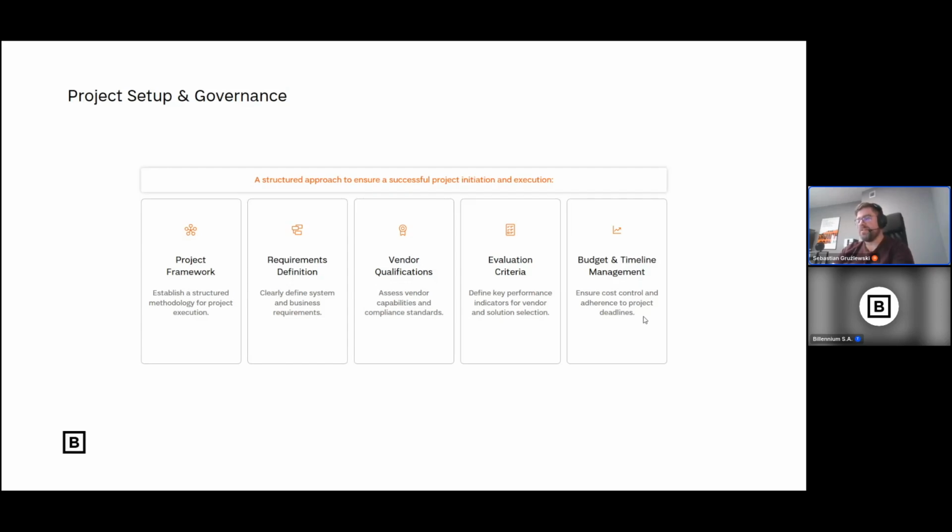You need to map your sample life cycles, because when implementing such a system, we need to think where we will actually start our process, because we can start in a LES system, but we don't have to. We can start from our LIMS system, if we have it, and interface it to a LES system. What happens with the sample? If it's a happy path, it just transfers information in one way or another, and we are done. But it's not always just a happy path, because human errors happen, system suitability fails, machines break.